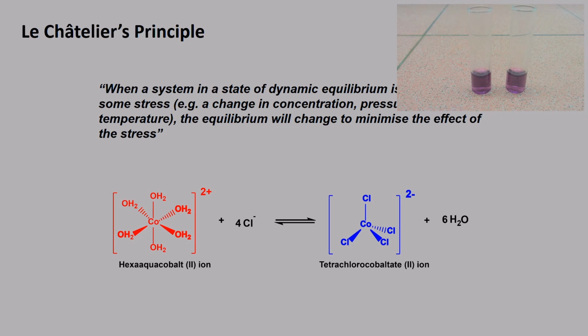And we can see that the reaction turns to a blue color from the purplish color of the equilibrium before. Okay, so that follows. This increases, the reaction proceeds to minimize this increased concentration.